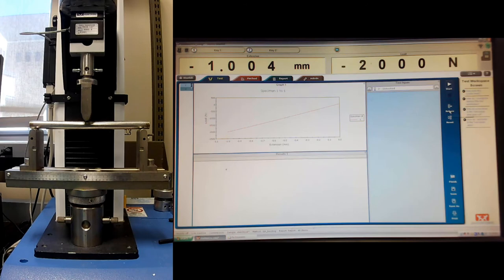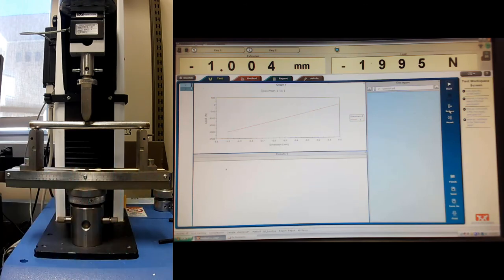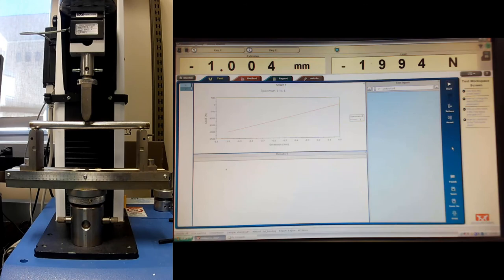I'm going to go ahead and test all the other materials I have for you guys to analyze and send you the data. But I'm not going to record the videos of that. I will record the video of testing the bone samples because they'll be a little bit different. We're going to have to set the post much closer together for those. But I'll show you that when I'm done testing all the other samples.